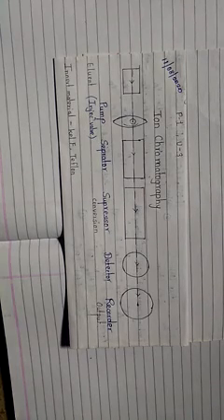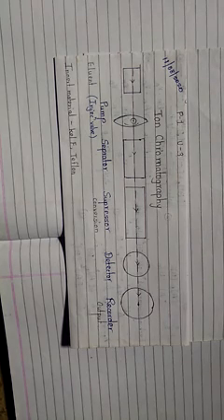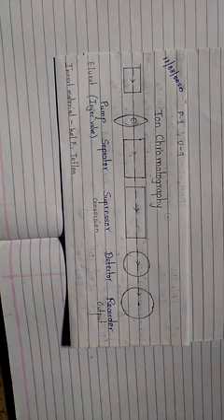Good morning to all. Today we are going to see the next point, ion chromatography. In ion chromatography, there is a principle, instrumentation and their application. First we see the diagram of ion chromatography.